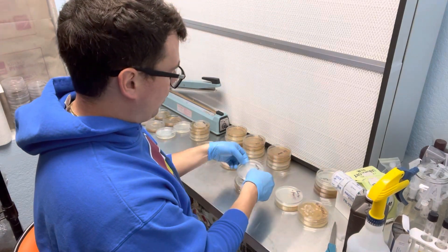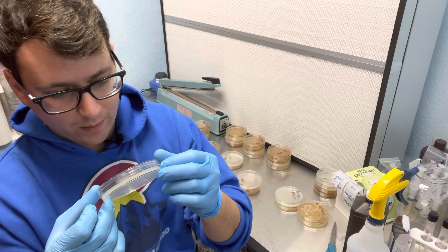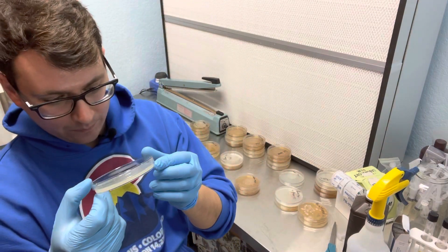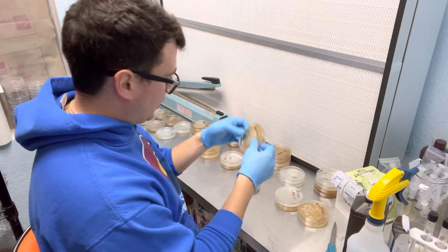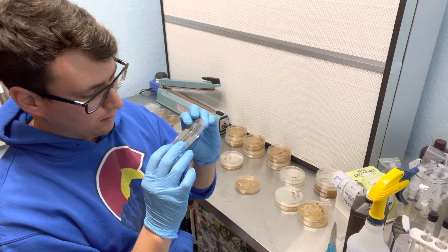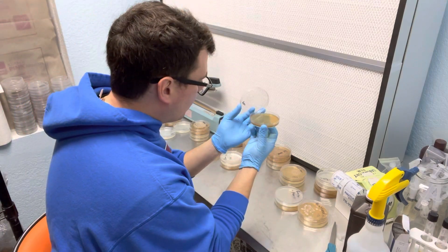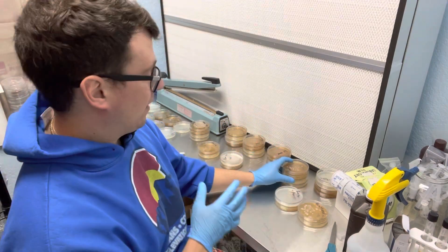So now I will go to the namiko, or folio to namiko. It's kind of the same as the shiitake — I don't see too much happening on this one. Still empty for the namiko.